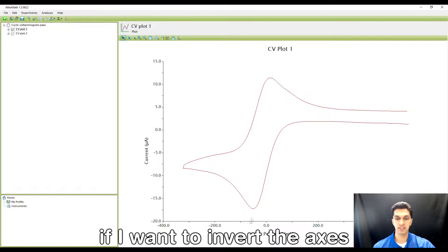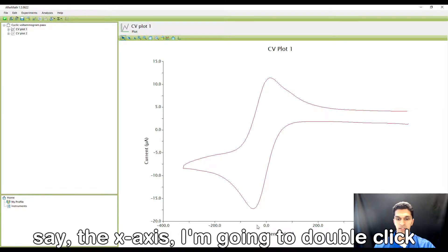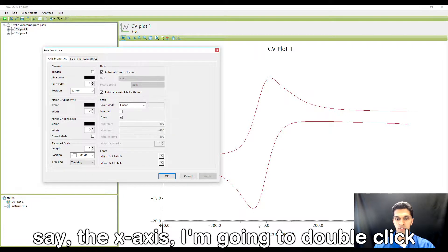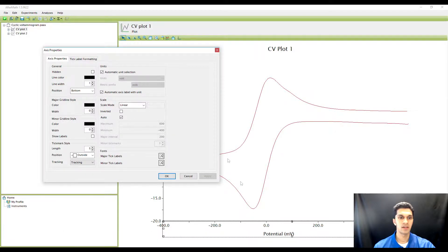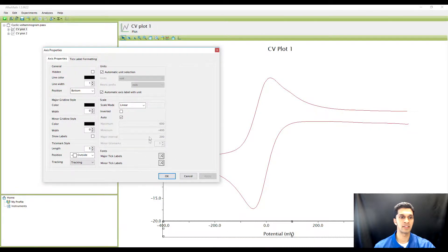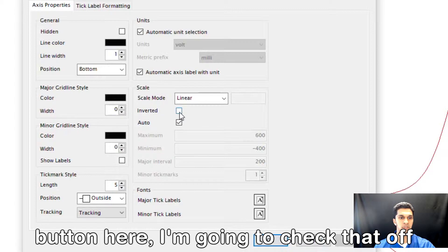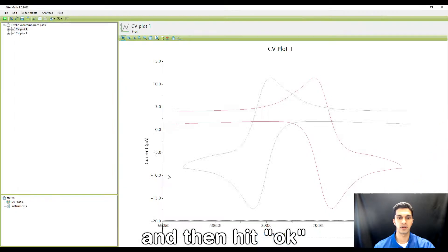If I want to invert the x-axis, I'm going to double-click and then the axes properties menu pops up, and in the middle there's this inverted button here. I'm going to check that off and then hit OK.